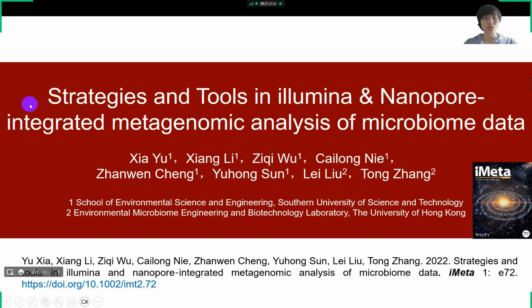Here I will introduce our review article on the strategy and tools in Illumina and nanopore-integrated metagenomic analysis of microbiome data.